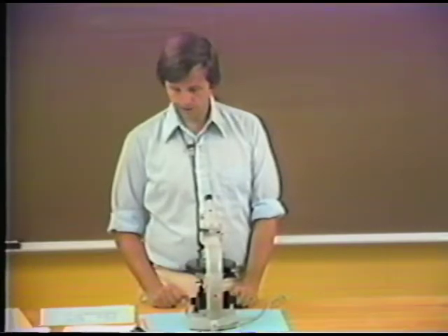for the O vibration direction than it is for the E vibration direction, or that absorption is greater in the O direction. So most uniaxial minerals have the opposite formula, the formula of E greater than O, but tourmaline has the formula O greater than E. And the only way we can make this determination is by using the interference figure to test the position of the E ray.